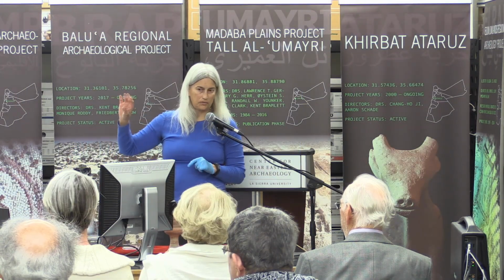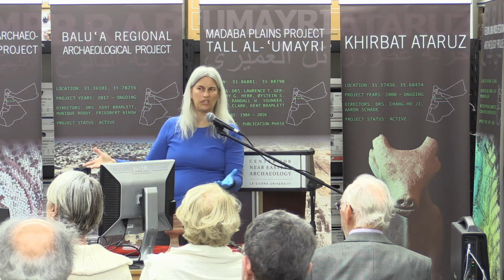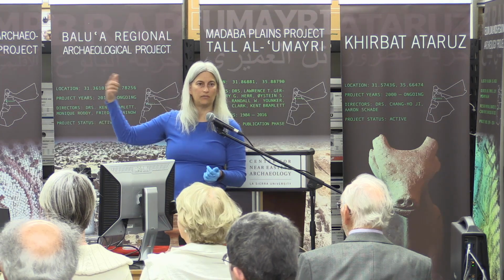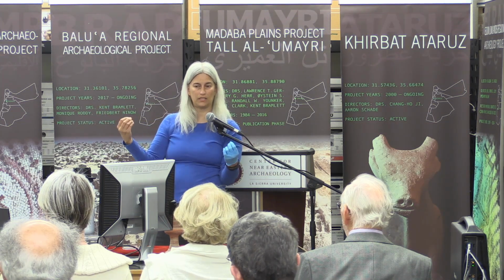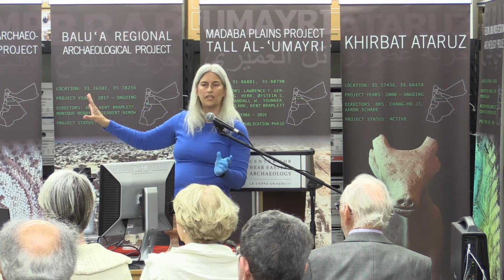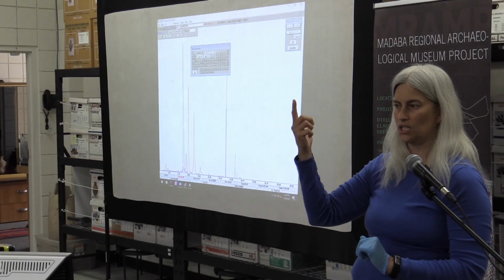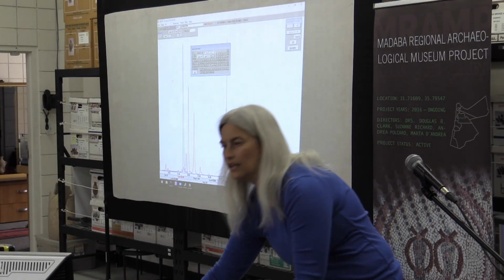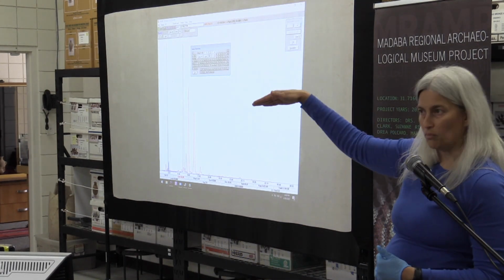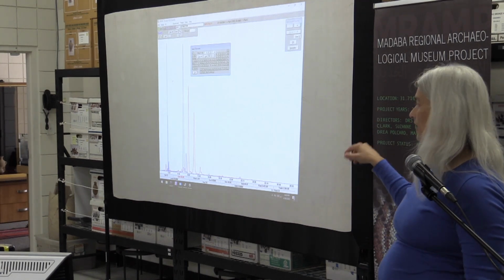And now I'm going to pause for just a second. So I'm going to a high molecular weight. These are very heavy atoms. And as they go higher in molecular weight, they have higher energy needed to move out. And I'm getting pretty high up there. Okay? So then I kind of have to switch which energies I'm looking at. So I'm going to change which energies I'm looking at. And now I'm going to switch back to the bottom. Okay, because now it has a different energy level that I'm looking at.